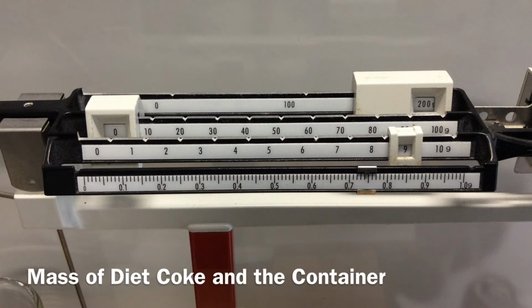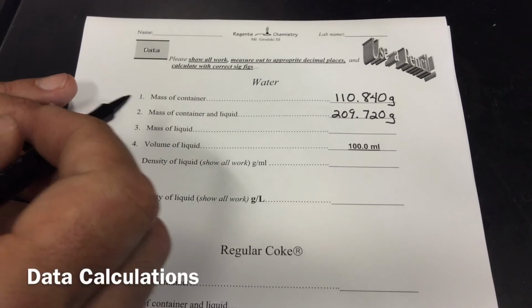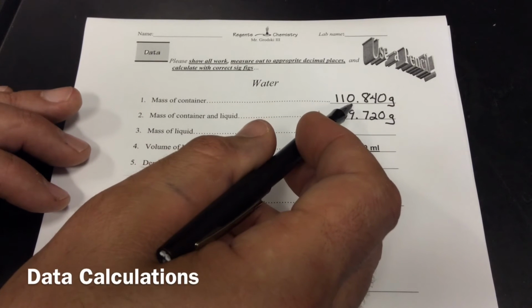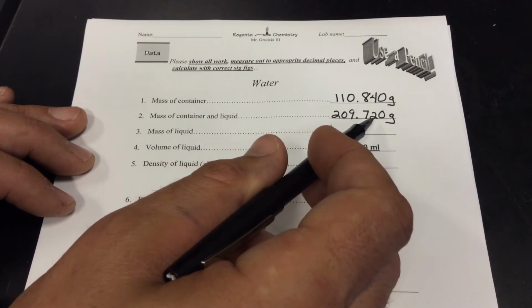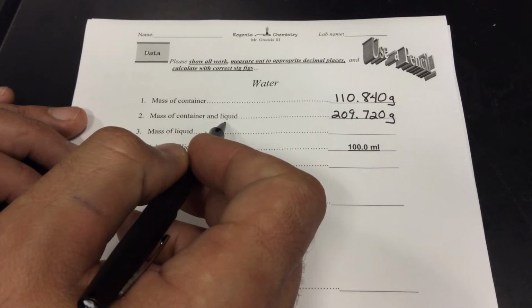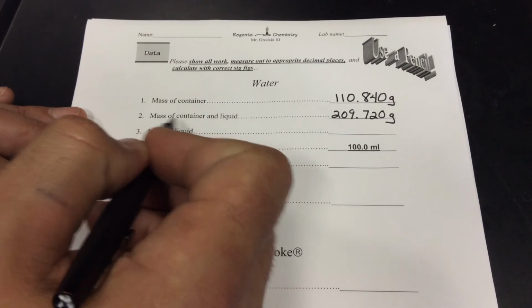And now we have all the data we need to calculate the densities and determine the mass of the Diet Coke in terms of its sugar. So I want to walk you through the calculations in this lab, at least for one liquid, and let's get started. We have the mass of the container, and that's 110.840 that I got from the video, and I got 209.720. That's the container and the liquid. Okay, so to get just the liquid, I've got to subtract out the container.